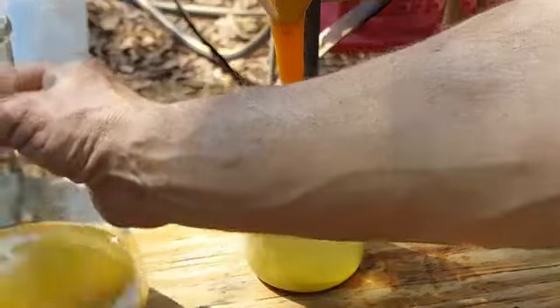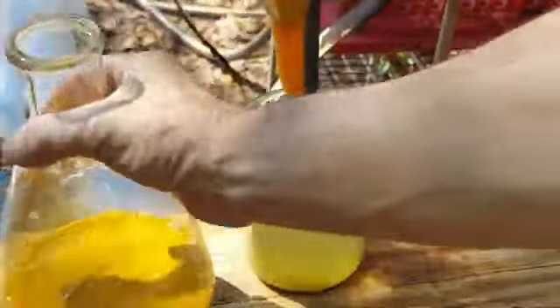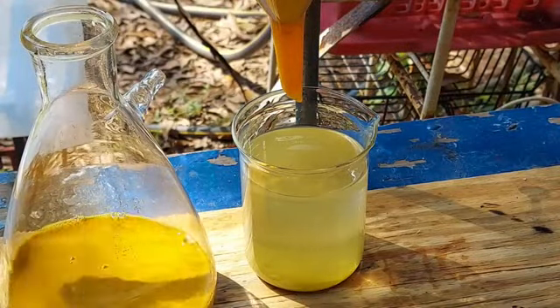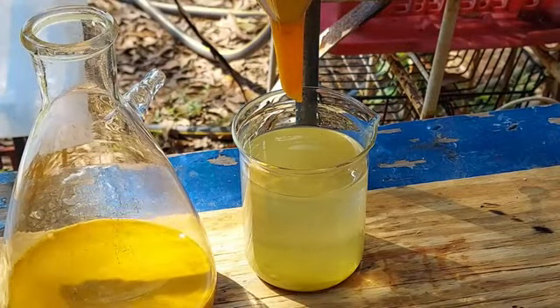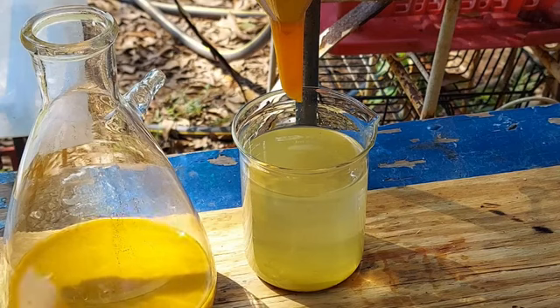Which is funny because, as you can see, it settles out as a suspension nicely. It's very heavy. I swear, this element is an asshole. It goes out of its way to be difficult. I don't know why. It just does. Anyway, I'll come back when we are ready to dissolve this in nitric acid, which I still have to make.